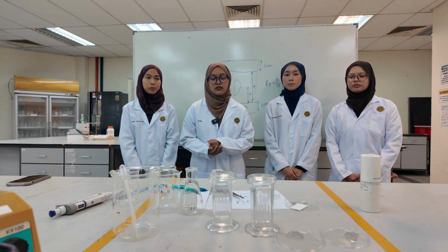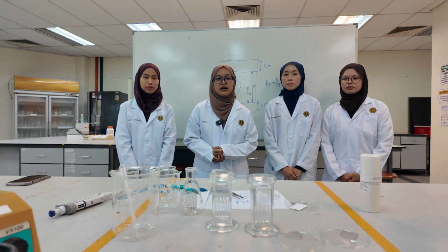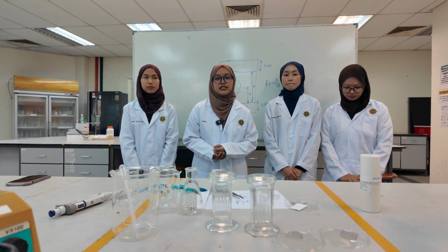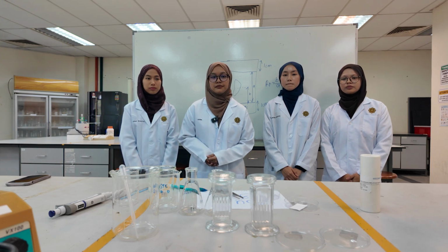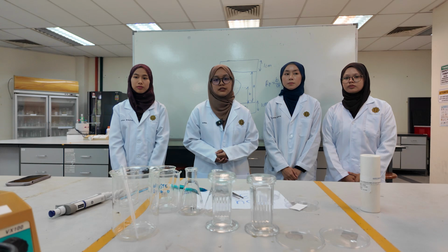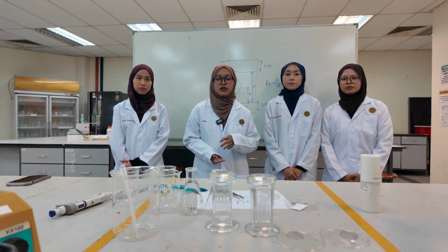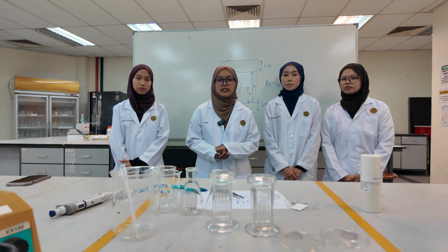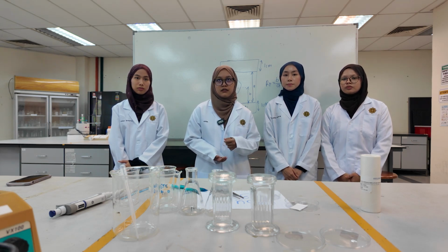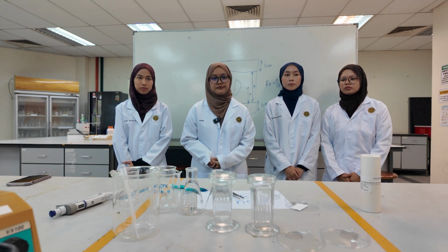Second, TLC is also used for monitoring reactions during drug synthesis. It allows us to detect how far the progress has been made during the reaction by observing the disappearance of reactant spots and the appearance of product spots.